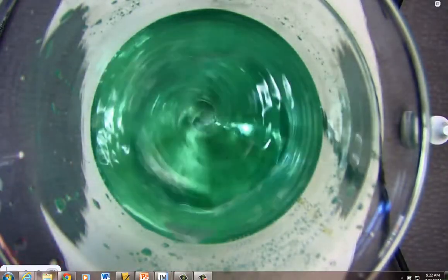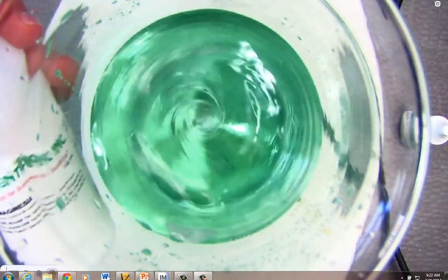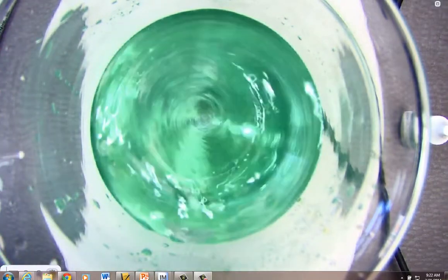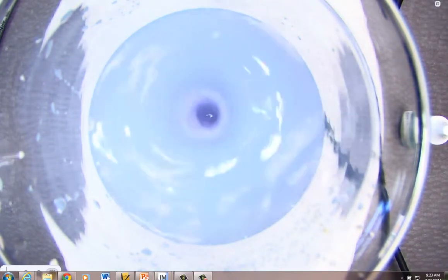When we add our strong base, the milk of magnesia, into the solution, we're going to see a color change, providing evidence that milk of magnesia is indeed not neutral, but a very strong base. Now milk of magnesia is quite chalky — it's a thick suspension, not even a true solution, but a suspension. So it's going to take just a little bit of time to dissolve well; just take a look at the color as it's coming out of our solution.